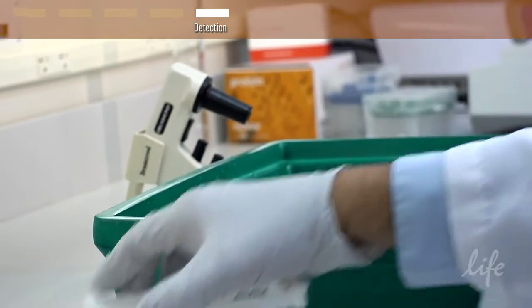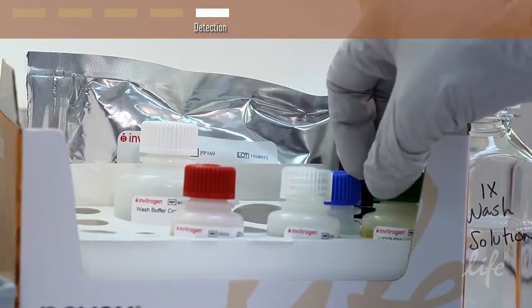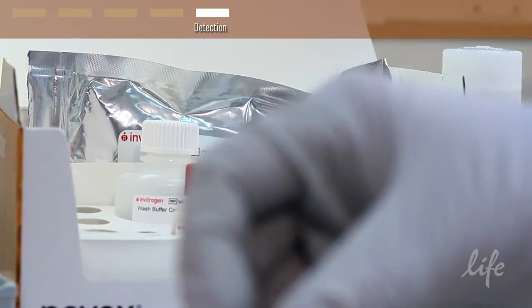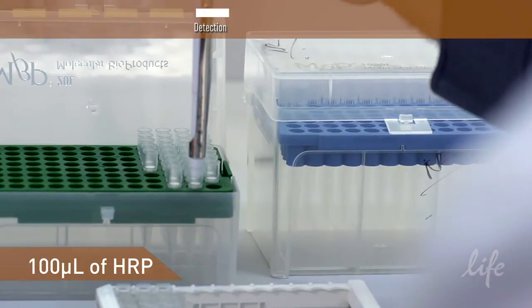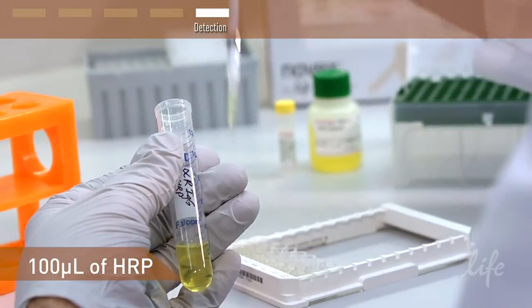Next, remove the detector antibody and repeat the wash cycle. Prepare the streptavidin horseradish peroxidase working solution. Then add 100 microliters of the HRP solution to each well containing sample or standard.